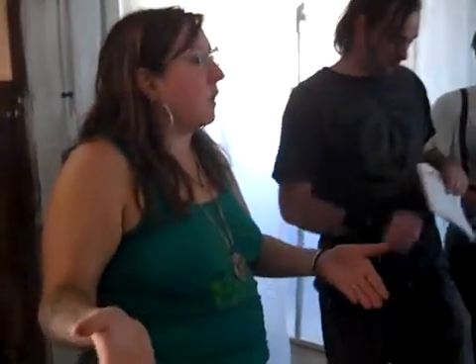Hours. I don't think I soaked it. I just got it wet. Yeah, you want to soak it. It's not just a quick dunk. You want to definitely get it in the water for... how long would you say? I'd say at least 20 minutes to an hour at the most.